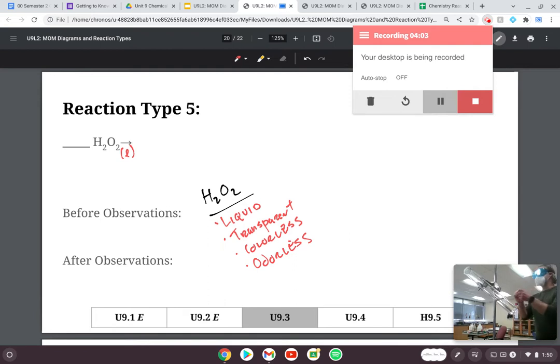So this is potassium iodide. It's going to be the catalyst. Now, the next thing I want to point out is if you have ever had a surgery or a very large wound, and the doctor or the nurse put a giant amount of iodine on your arm or wound, what color was that? It was like this yellow brown, right? There's iodine in potassium iodide.